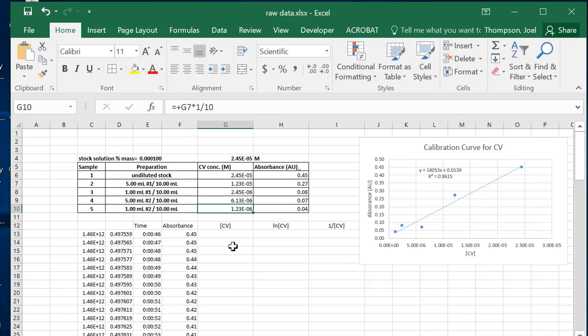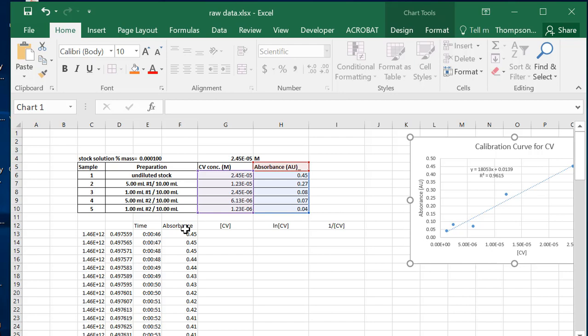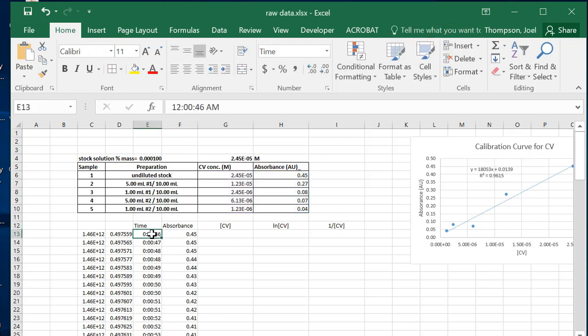All right. So this is absorbance versus time, and that's fine. What I would like to do is turn these numbers, which are a separate piece of lab data, into absorbance versus elapsed time, which means the first reading is at 0, the second reading is at 1 second, 2 seconds, 3 seconds. It's interesting that the time coming off this instrument reads like a clock. Somebody has recorded only the seconds in here, which is helpful, but this is actually clock time, and I can see that up here.